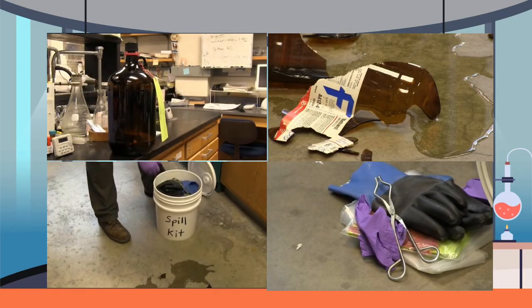Checking for safety first. If you hear the telltale crash of glass, take a deep breath and stop. Before you grab a single paper towel, ask yourself, do I know exactly what was in the bottle? Safety is our top priority, so you should only handle the cleanup if you are being trained and know the chemical isn't a major hazard.